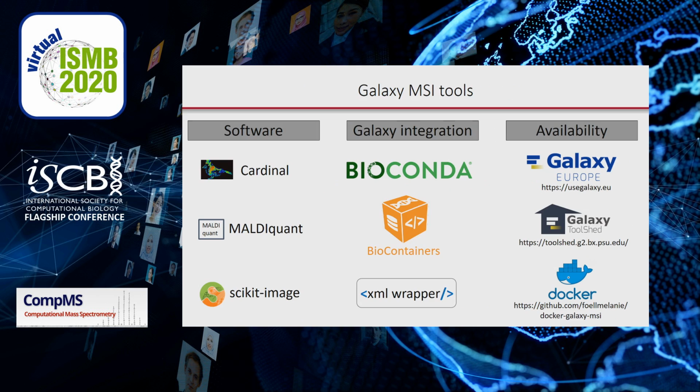To build MSI tools in Galaxy, we have integrated a variety of existing open-source algorithms. Most functionalities are based on algorithms of the versatile MSI software Cardinal. MSI preprocessing algorithms were used, as well as scikit-image as basis for the development of image co-registration and regions of interest annotation functionalities. For each software, we have built conda packages and containers to allow automatic installation of all dependencies and version control of the MSI Galaxy tools.